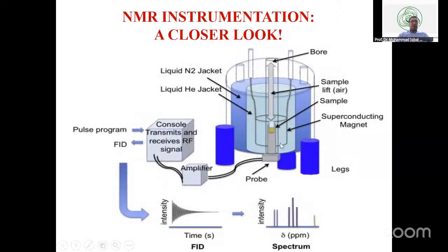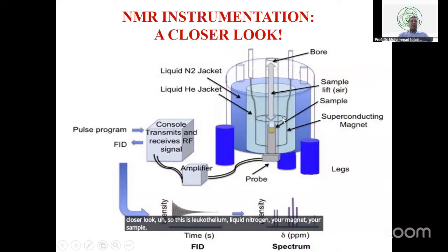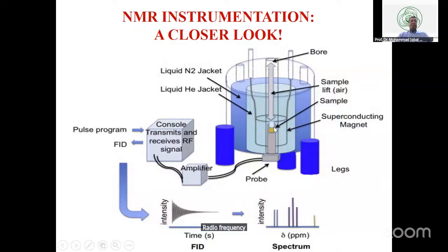A closer look. So this is liquid helium, liquid nitrogen, your magnet, your sample, radio frequency oscillator, detector, and instead of absorption, you record free induction decay. That is the theoretical and conceptual difference.